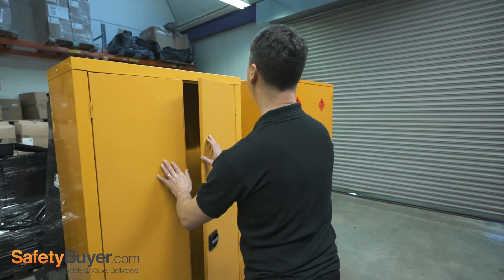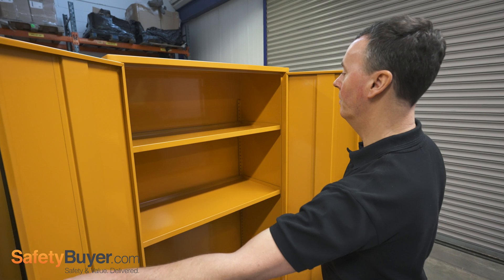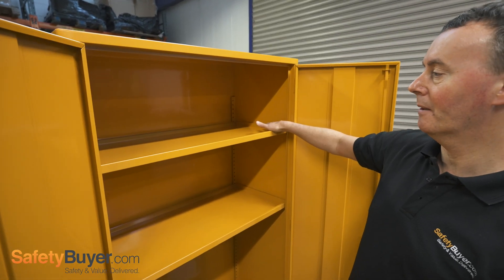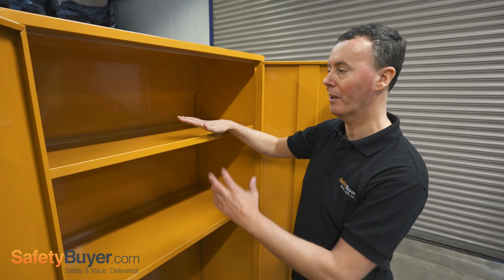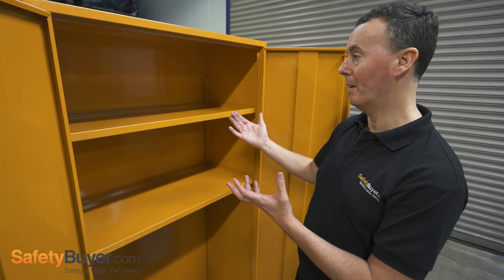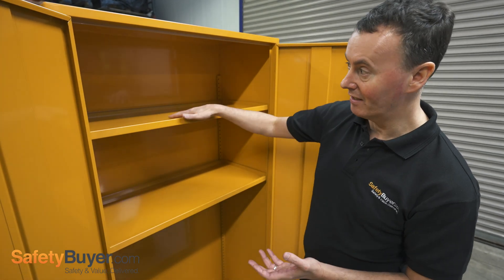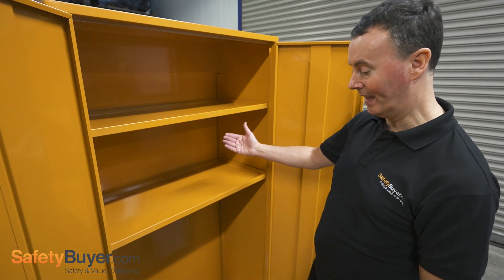The shelves in this model are not perforated. They have this lip on them and they're fully welded, so they actually act as a small spill tray. Any minor spills or drips can be contained in each shelf. If the worst happens, a shelf may be overloaded or a large container is not put in securely and it overloads the shelf or runs down the back of the cabinet.